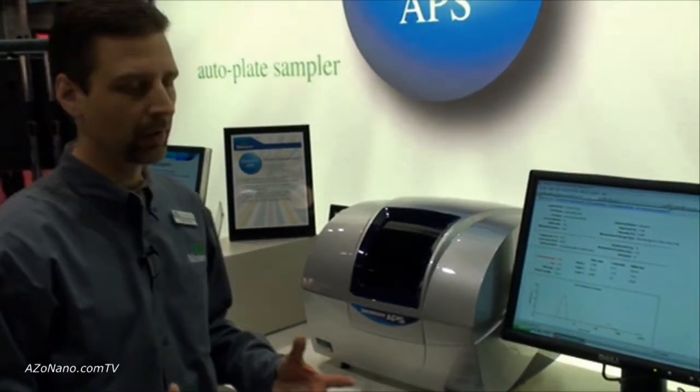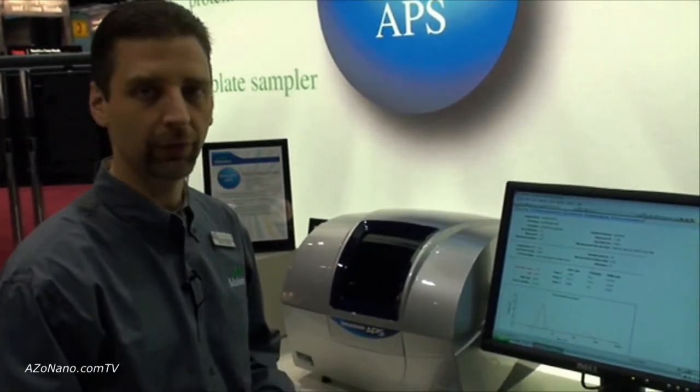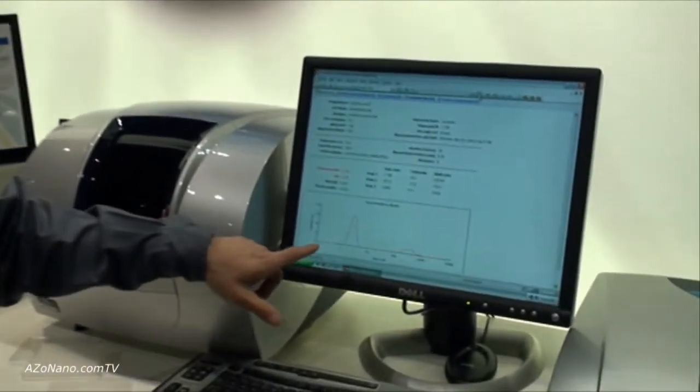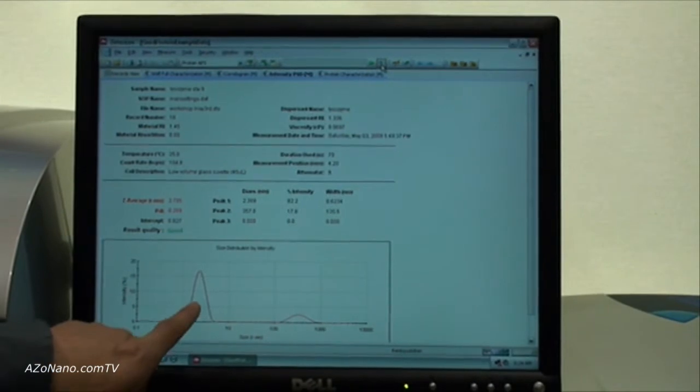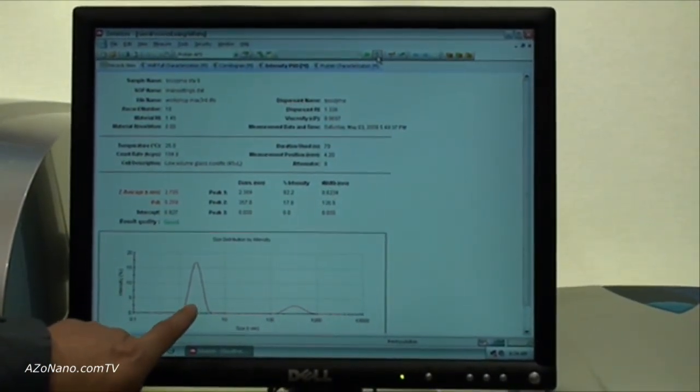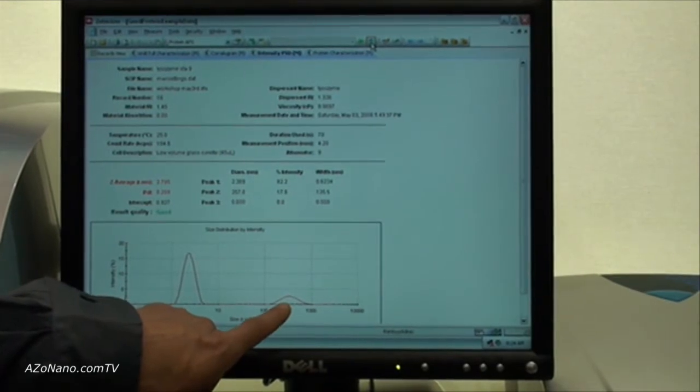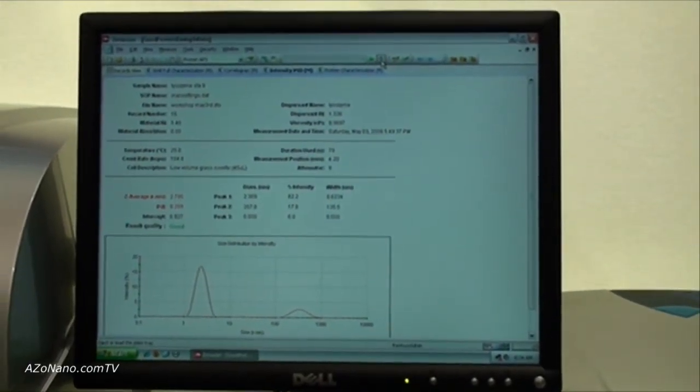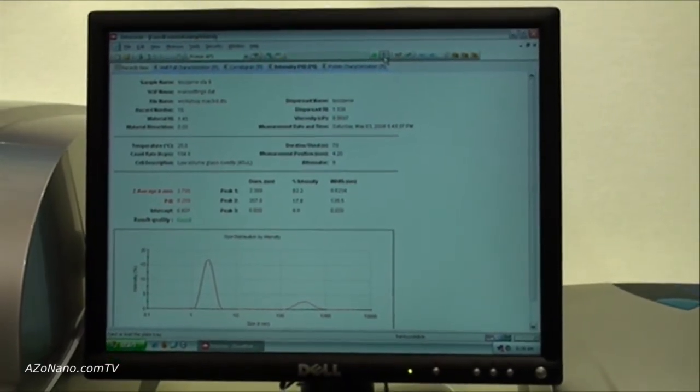It's very simple to use from the operator's perspective—very intuitive, user-friendly software. This is an example of a data result. This happens to be a protein that we measured. We have the size of the main peak of the protein, and we can see there's a small amount of aggregation. We can quantify exactly how much that is.